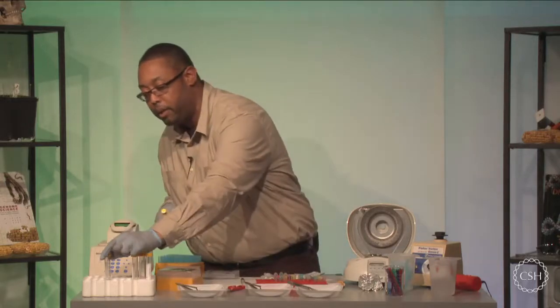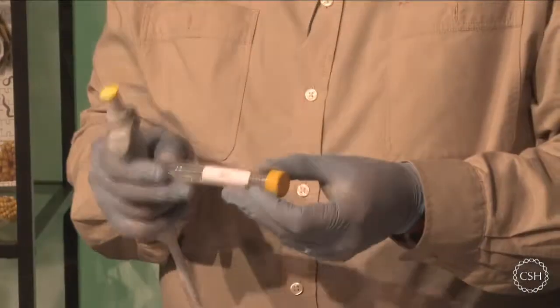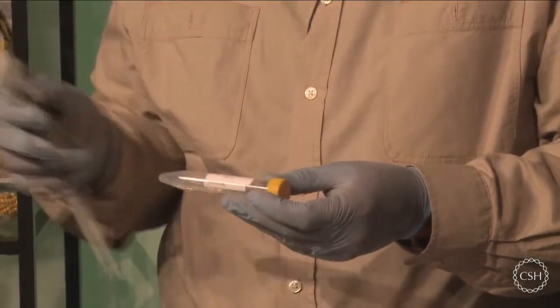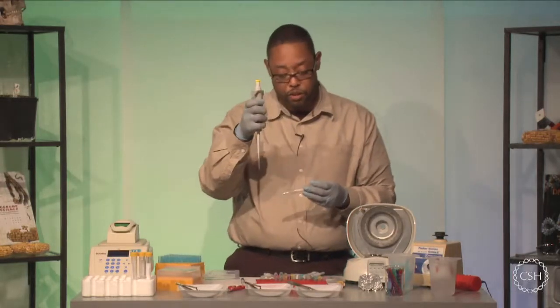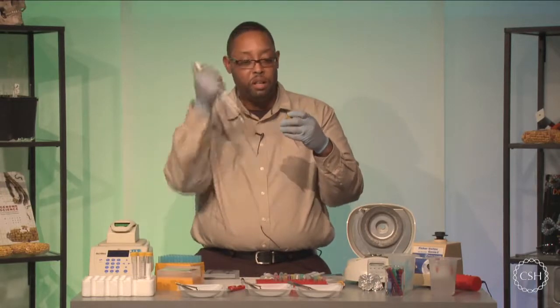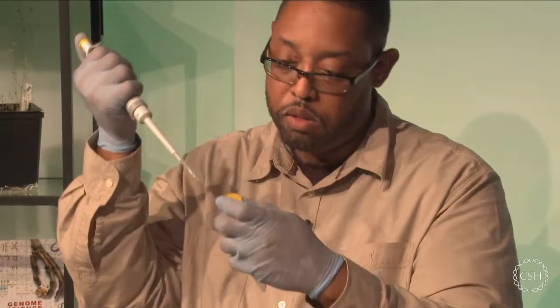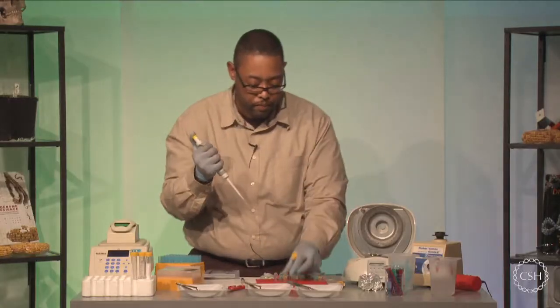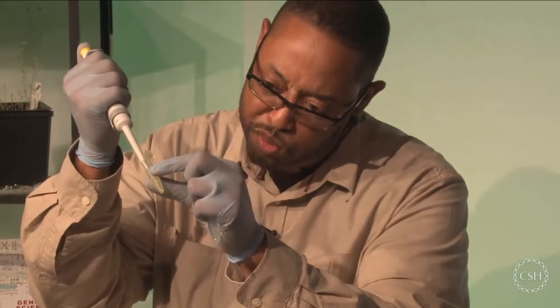To do that, we can use water or dH2O. You can choose to use Tris and EDTA or just Tris at 10 millimolar. So with my pipetter, my P100 set to 100 microliters still, I'm going to add 100 microliters of distilled water into each of these test tubes. I'm going to make sure I add my water directly to the pellet.